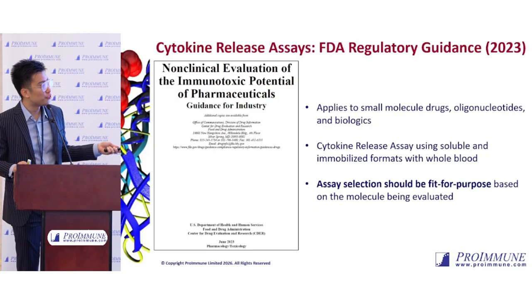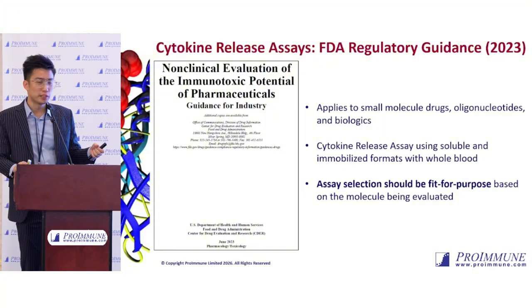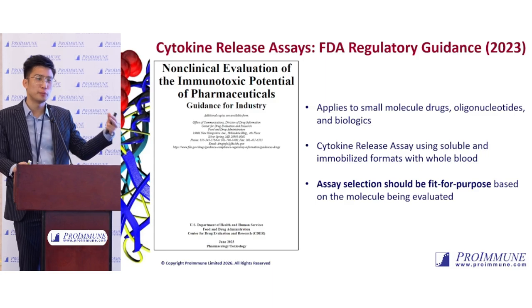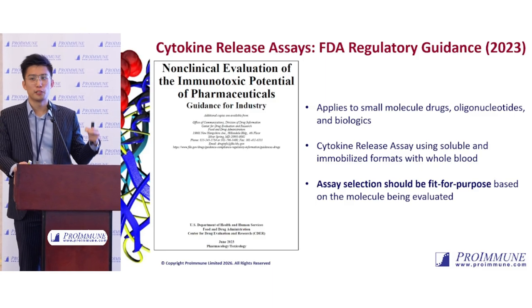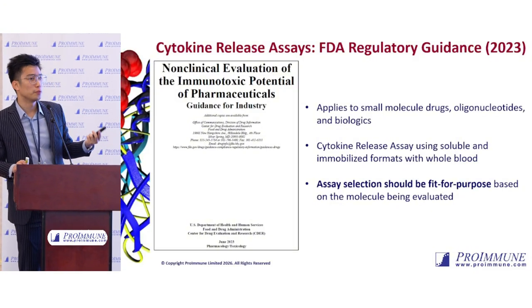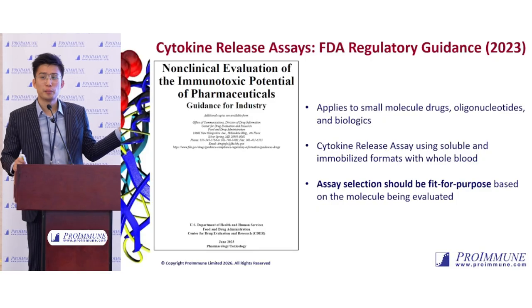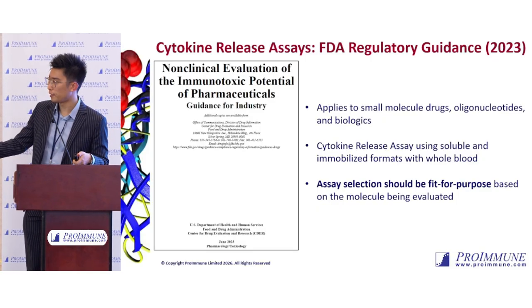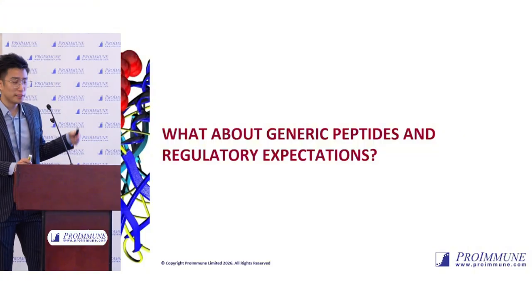And I think this is really the key here. Assay selection should be fit for purpose based on the molecule being evaluated. The principle of the assay remains unchanged, right? You just look at the cytokine readout, you just incubate test article into the blood itself. But the study design is actually where it's critical to see if it can address the question you're trying to answer. This will be covered a little bit more in the specific example of how we design the study for generic peptides, which is here.